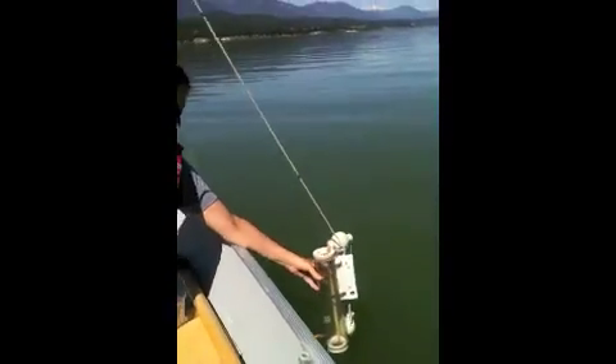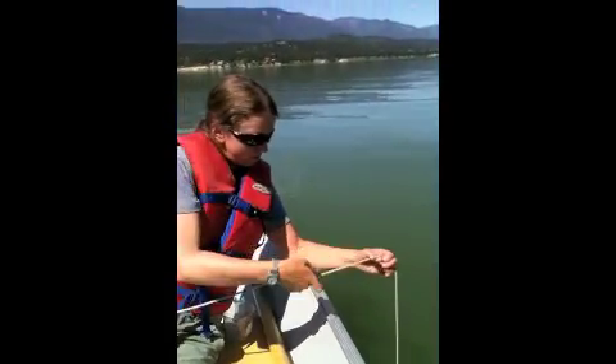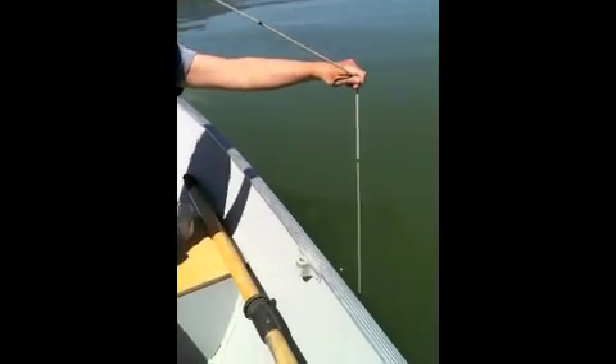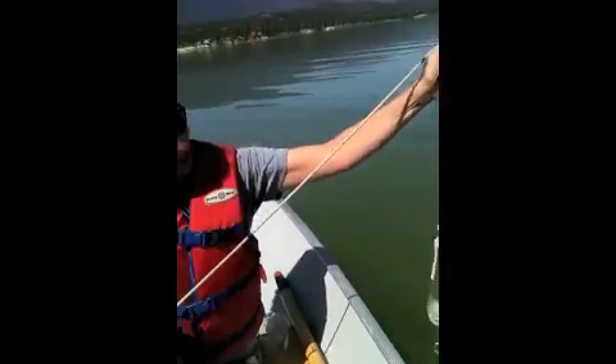Here I am lowering it over the edge of the boat. That's a half. One meter. One and a half. Two meters. I have to give the messenger a little bit of force just to make sure it closes. Just like fishing — pull in my catch. And there I have my water sample, two meters down.